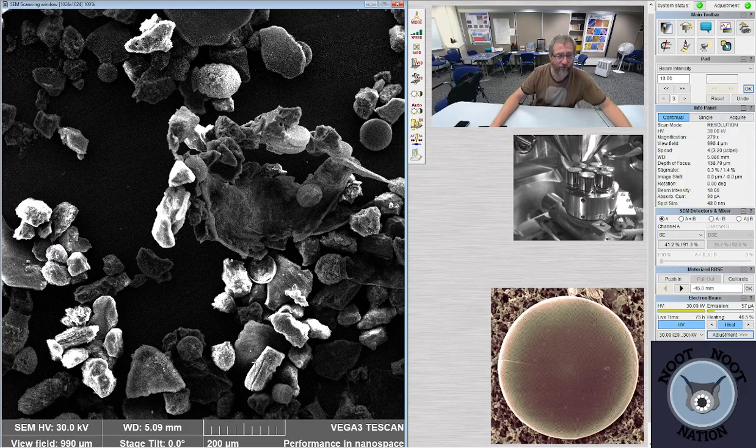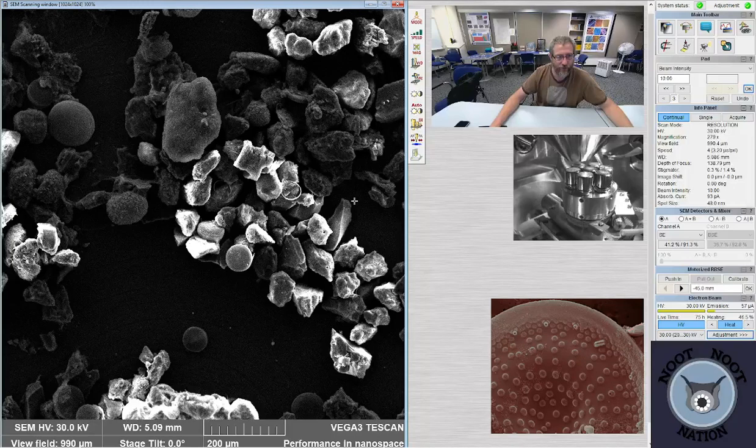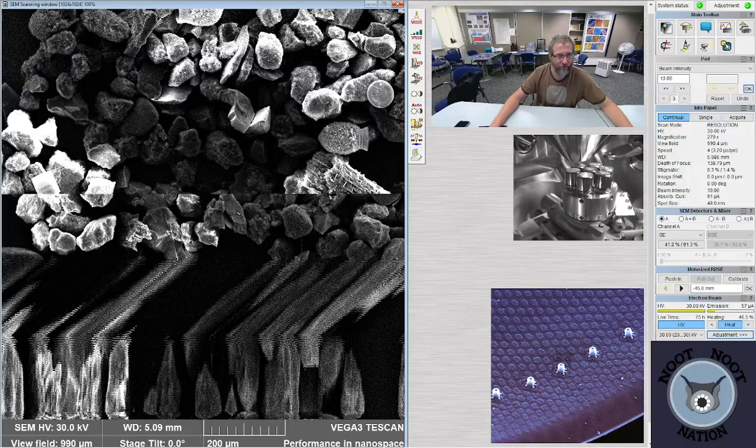My colleague, Dr. Winter, will sometimes put samples that have been filtered through filter paper on the SEM. They'll see a bunch of really beautiful dinoflagellates that way. So, could be there's just a lot of junk around them that needs to be pulled off. Seeing a lot of tintinids, though, in these samples.